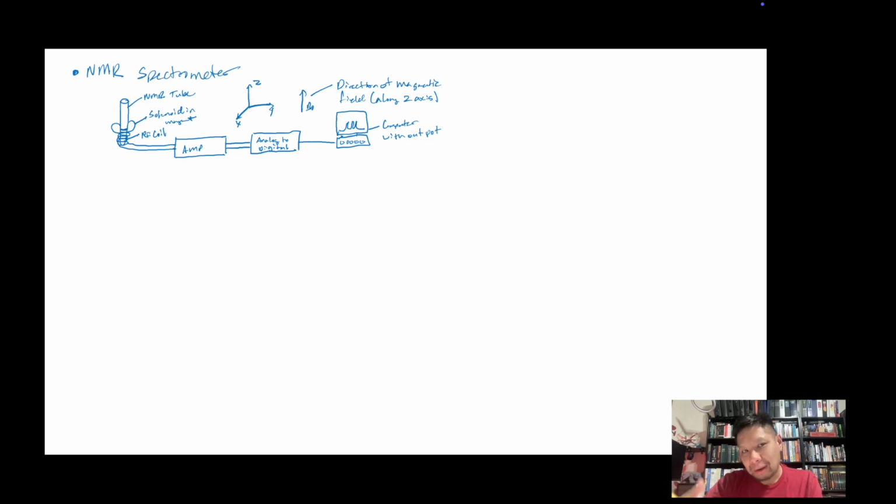That makes the magnet much stronger than a normal electromagnet, right? And so that's how we're able to get these huge numbers of Gauss that you saw in the previous lecture, right? Which corresponds to things like the 500 megahertz or 600 megahertz NMR or even a 1 gigahertz NMR, right? Because these NMR spectrometers, they really push the limits and they get bigger and bigger and bigger. Because, for example, the one I used was as tall as 2 stories, and you'd have to climb up a ladder to load the sample. The biggest one actually is 2 stories tall, and you'd have to walk across like a sky bridge to actually load the sample inside the building.